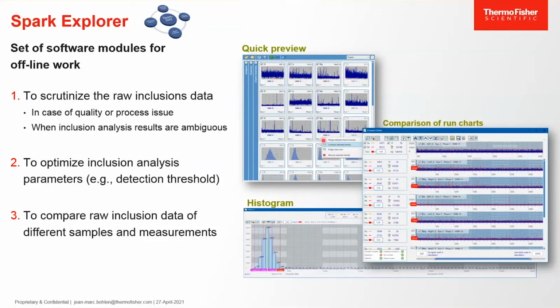You can also see the histograms, the size distribution of the inclusions in terms of element. So here, of course, you have a module to look at the histograms, and a module to look at the run charts. Especially this one is interesting because you can compare many different channels or samples. Kajan will briefly present you this tool afterwards.